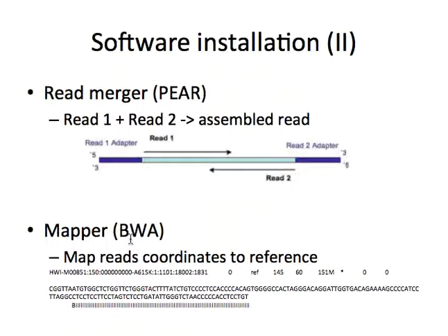Then the second very important software is the mapper. We get this list of sequences, then we need to compare them to the reference to get the coordinates of where they map and also to get the differences. The coordinates are a number, and the difference is encoded in what is called a CIGAR field, which is this one. In this case, it would be a 151 match.